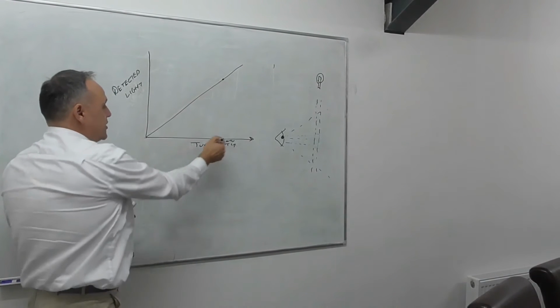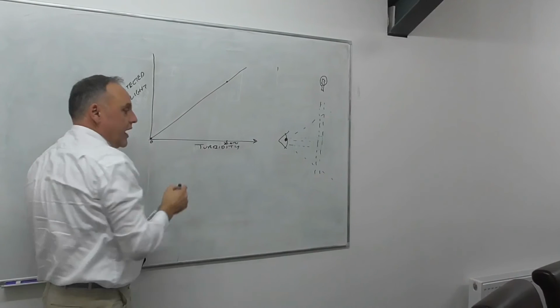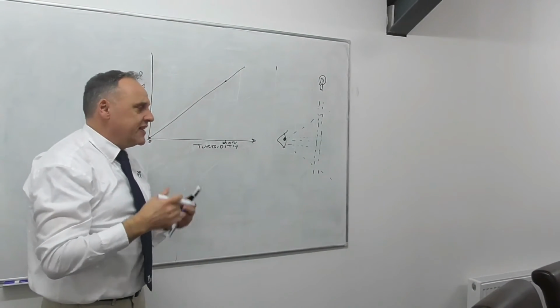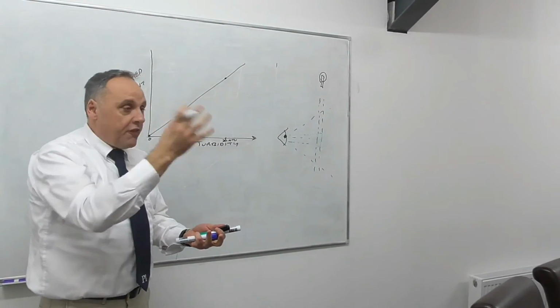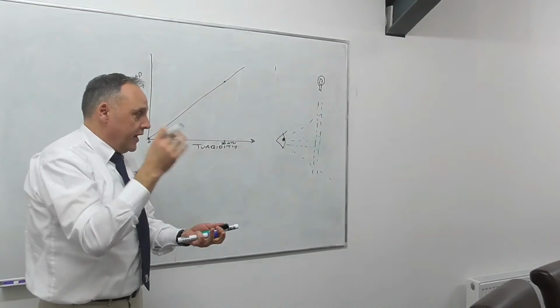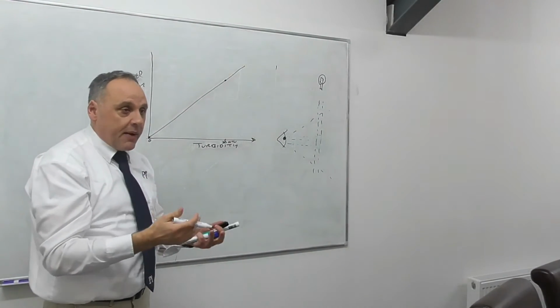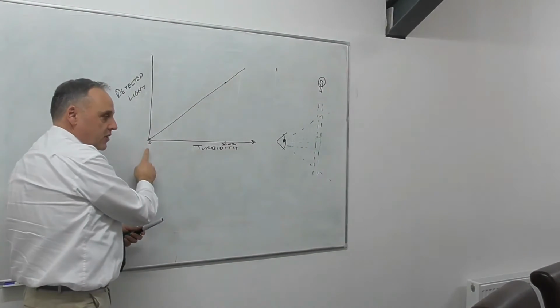So you end up with a 20 NTU and a 0 NTU, and that's how you draw the graph. The problem with that is getting 0 NTU water is incredibly difficult. Even just opening the packet, particulate from the atmosphere will go into the water and create an interference that will contaminate that. So very, very difficult to get a 0 NTU water.